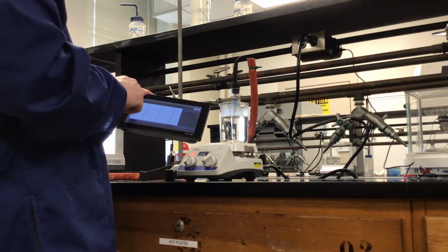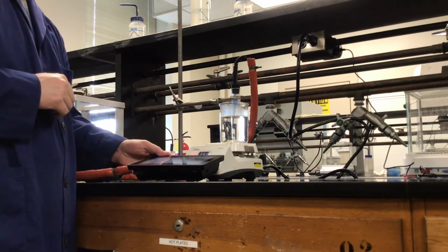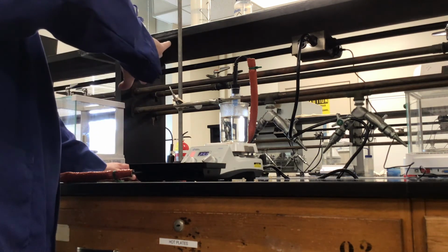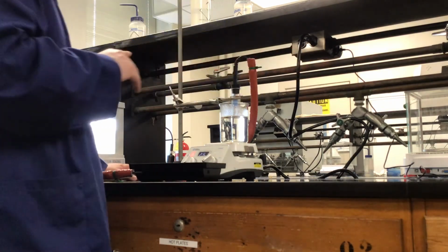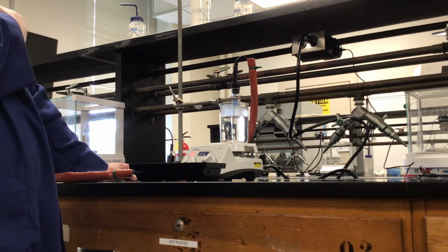And so we'll actually see this. It's going to start increasing here on the screen as we go, and I'll show this screen in a minute as that temperature continues to go up. Our temperature is going to keep ramping, but at some point it's actually going to stop and plateau. This is the one thing I didn't show visually previously when we were going over some conceptual ideas for the experiment.